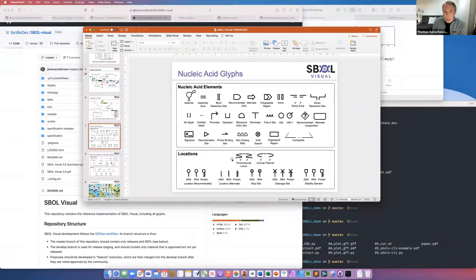And to be honest, I'm not an expert in all these different fields, but I know that the way people represent chromosomal locations is different across fields anyway. So this would be one of the areas where we wouldn't be able to enforce a particular standard, because in your specific field, you might have a very well-defined way that you do that, which is different from someone else. So we're not instilling any fixed way that has to be done, but you can obviously annotate this with text however you like. That gives you the freedom to use the most appropriate method.